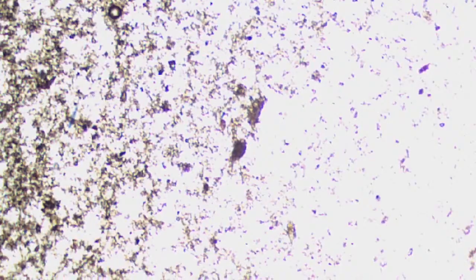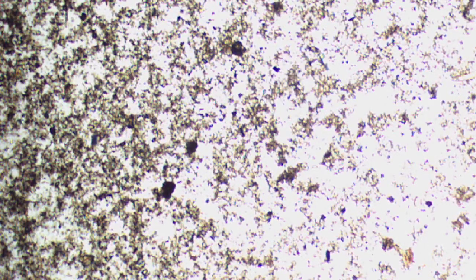Try it now. I was able to flush it a little bit with some fresh water so it's not contaminated from the other sample. This one's a little darker because it has some suspended, very fine mud in it. And I've often gotten some amazing samples from this section of the waterway. Might be a little too dark though, let's see. There should be little things swimming through it. There he goes, a little nematode doing its business in the muck.